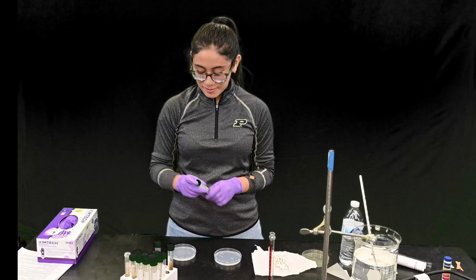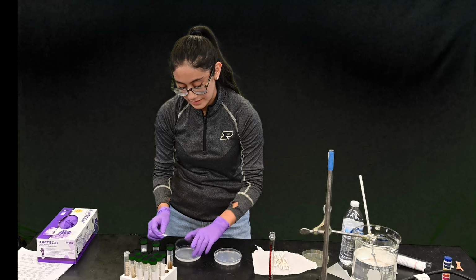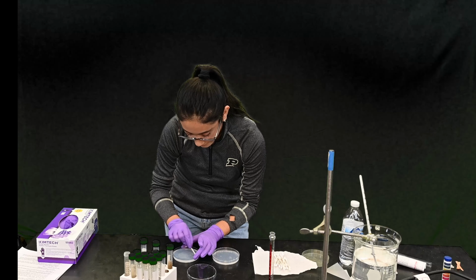Now we're going to do our dilution number 3. We're going to mix our tube and repeat this step. You're going to add 5 drops, and use your Q-tip to spread all over the plate.